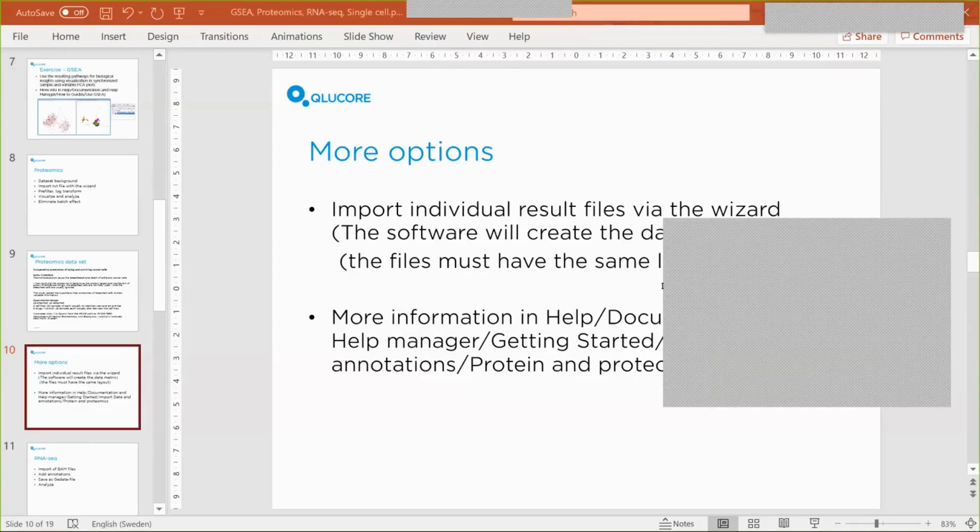Yeah, exactly. So in this last analysis, I didn't remove the covariates, which of course I could have done or should have done. So I just wanted to show you different options that you can actually focus on only the detached cells if you want. But of course, you could have done it in the same way. You could have removed the batch effects here as well, because they were equally distributed within the groups of the detached as well. More questions? No, then we move on.